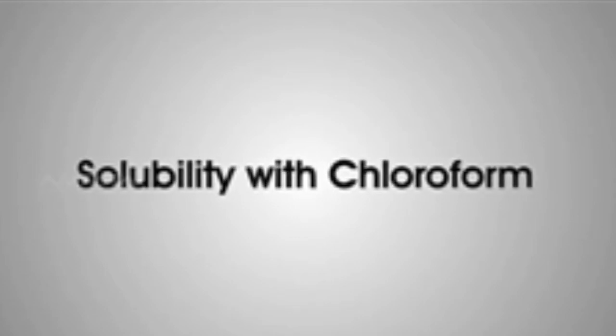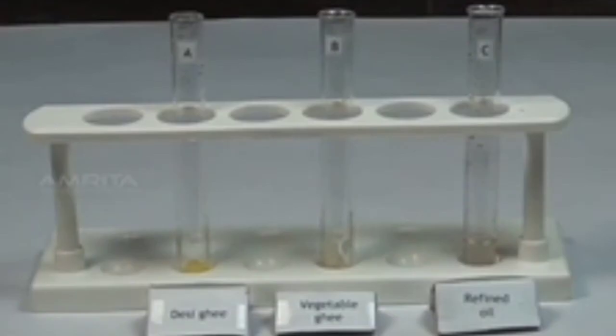Solubility with chloroform. Take a small quantity of desi ghee, vegetable ghee and refined oil in 3 test tubes A, B and C respectively.